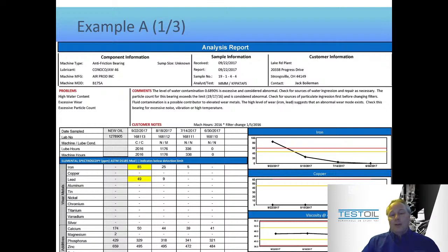And that's a very common question I get. People ask, well, don't the computers just comment on the reports? It's like, well, computers are capable of doing that, but computers just follow basic rules. And a human can sometimes reinterpret those rules and say, nah, I think that's okay. And sometimes they go, I know it looks okay, but I don't have a good feeling about it. So we use human eye review to make sure that we've given your report one pass with some reasonable logic that just can't be programmed by a computer.